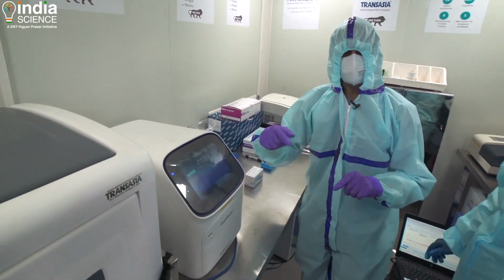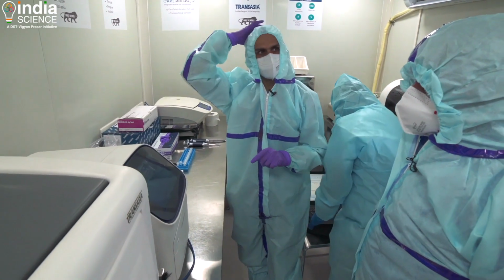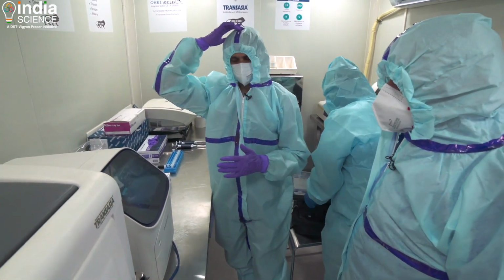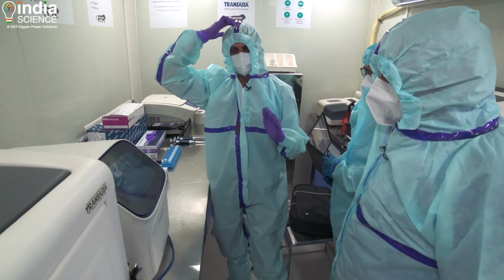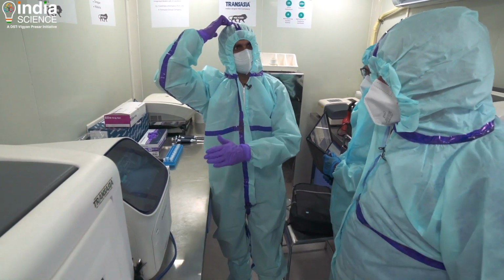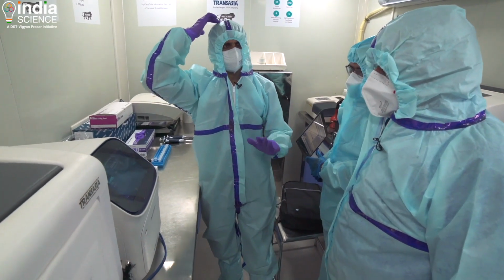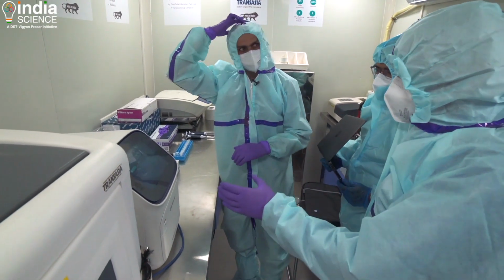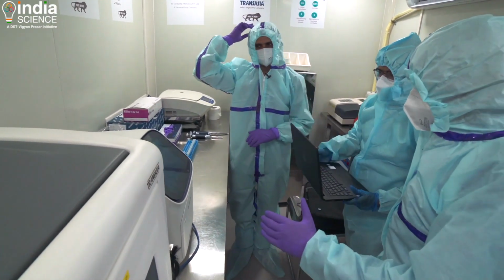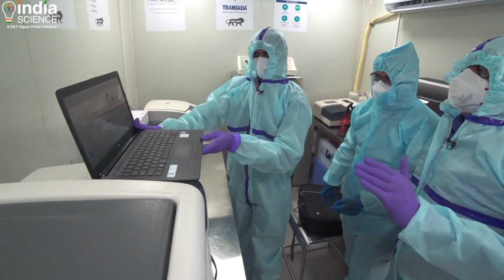Here the RNA amplification takes place, and it takes about 1 hour 40 minutes for each run. You can process up to 45-50 samples. When we start at around 9 o'clock, by 11:30 we start our RT-PCR, so we get our results by close to 2:30, 3 o'clock. Now, assuming the run has been completed, how do we know whether a person is negative or positive? How do the results show?